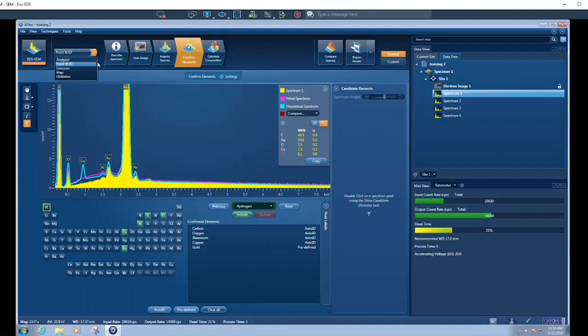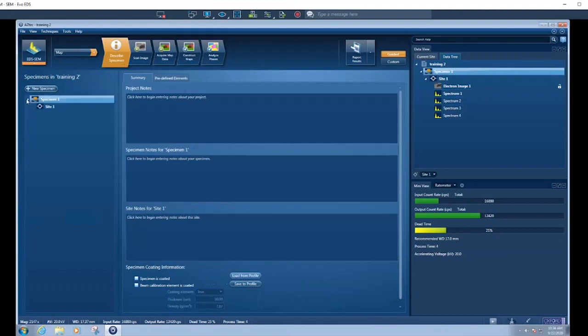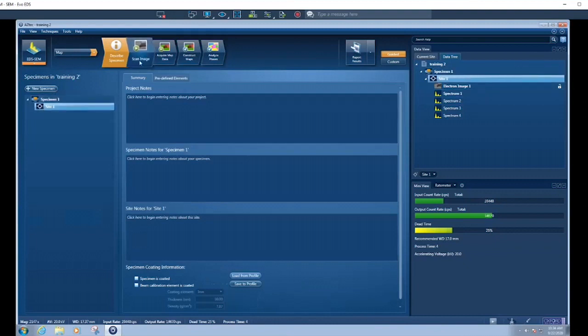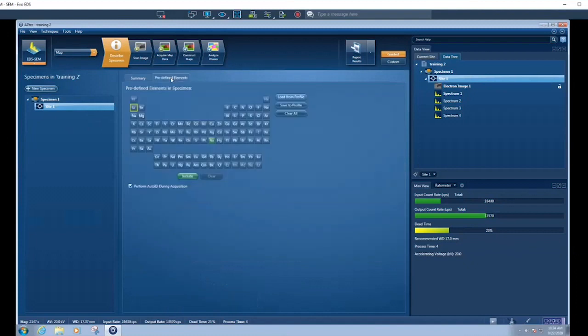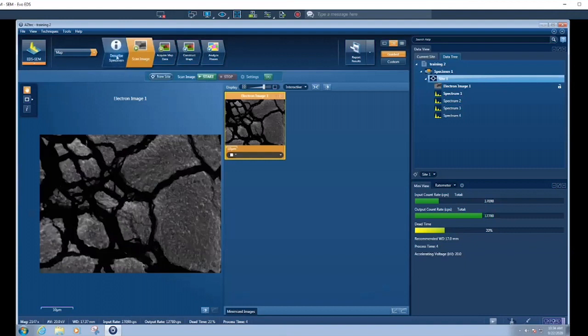Let's go now over to doing a map. We'll go over to map and it brings us back to the first step, describe specimen. Let's go to a different region, so we're going to keep it on the same specimen, so we can keep the same predefined elements. Every time we do a new specimen we can predefine different elements.